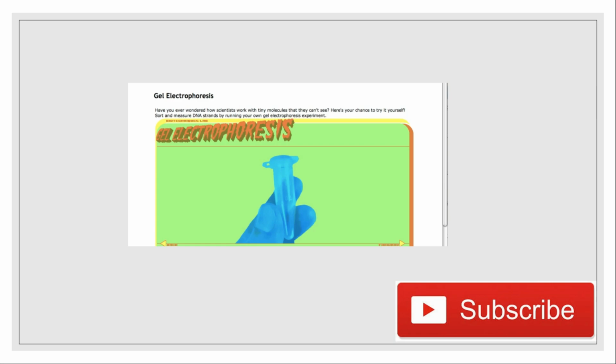In the figure you can see a vial that has the DNA, and we can further process it for gel electrophoresis. We will see how to prepare this sample, how to prepare the agarose gel, the casting unit, and the other things. So in the coming video we can learn the detailed information regarding that.